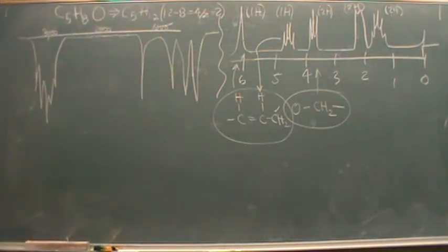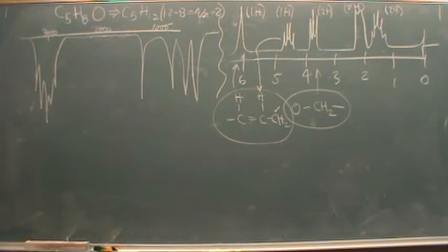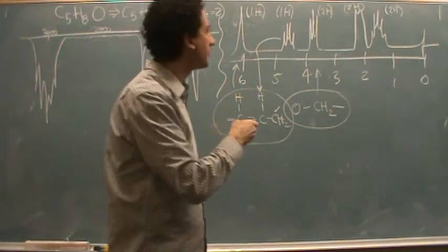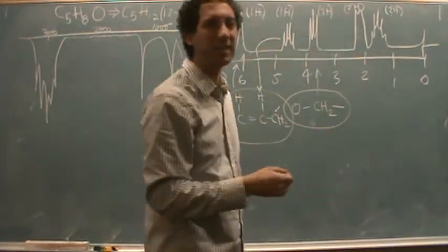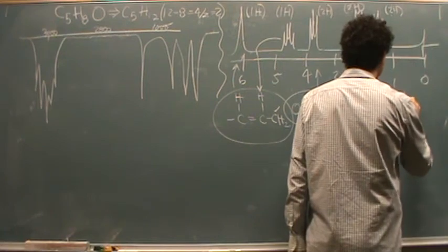Now let's go over to the other side there. How I drew them is as messy as it looks on the original. They're both pretty ugly looking. We can at least say they're multiplets, but I think they're the furthest away from the double bond or the oxygen. And it looks like they're both CH2s. They're both in the normal kind of alkane range. So I'm thinking it's a CH2 and another CH2.